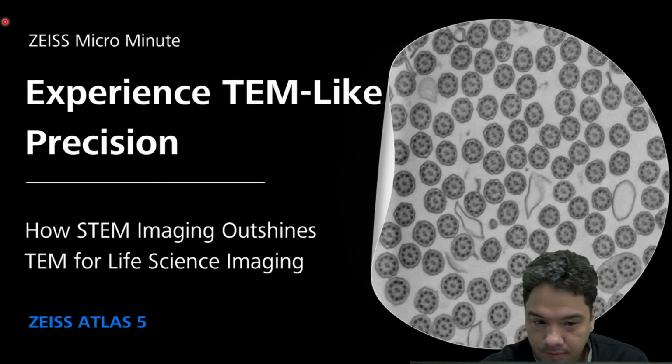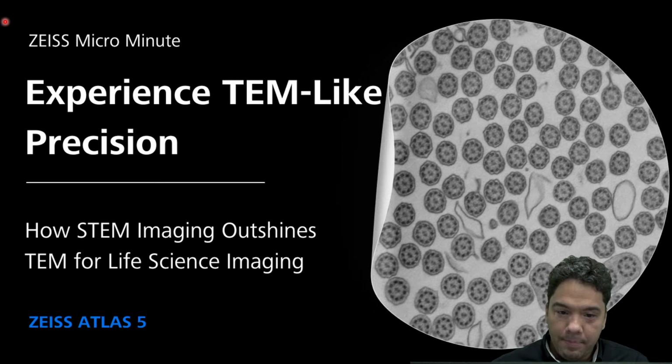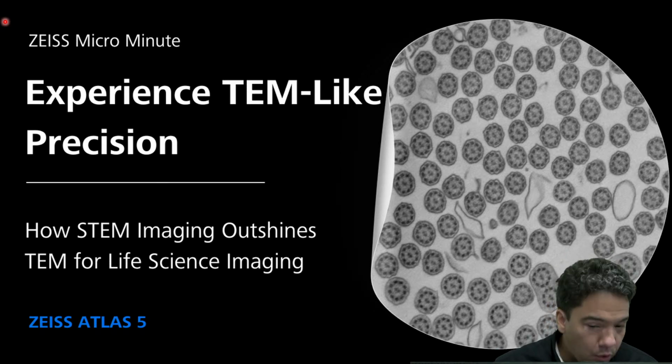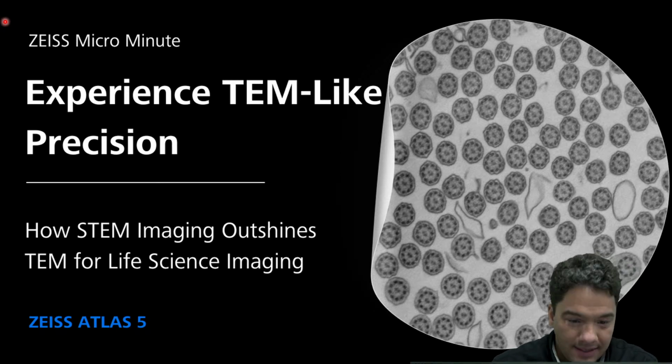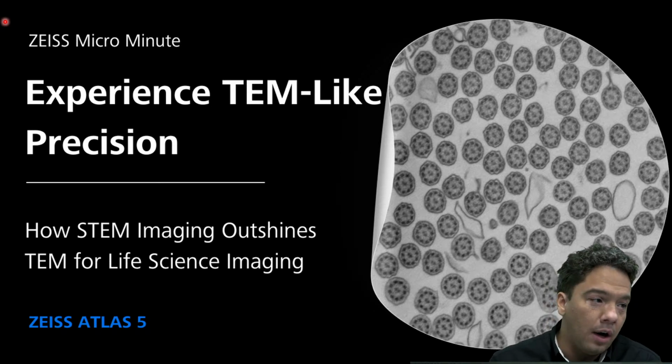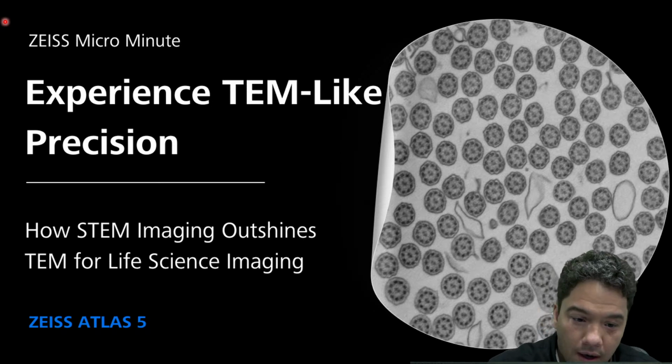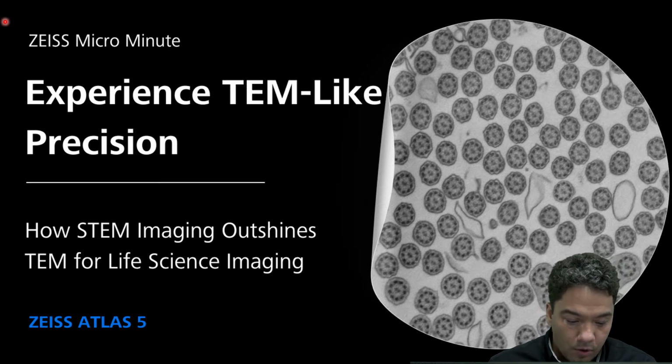Okay, let's start. To start with this episode today, we are discussing how to acquire TEM-like images in your SEM, what capabilities you can have for life science applications especially, and how to increase your throughput if you are interested in this kind of workflow in your day-to-day work in your lab.